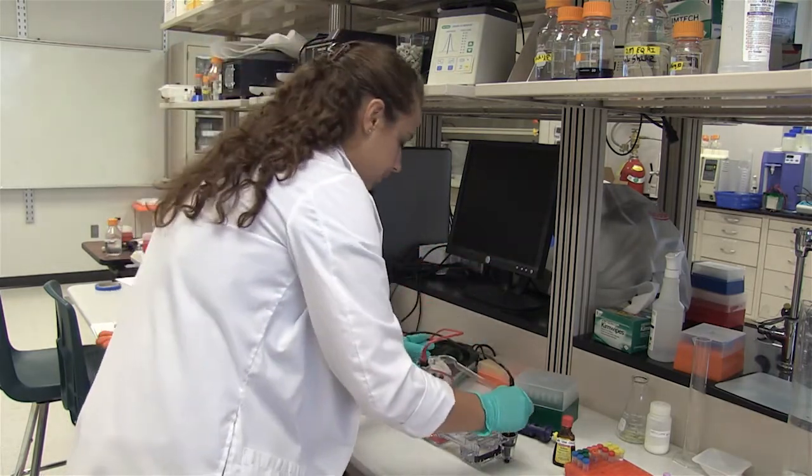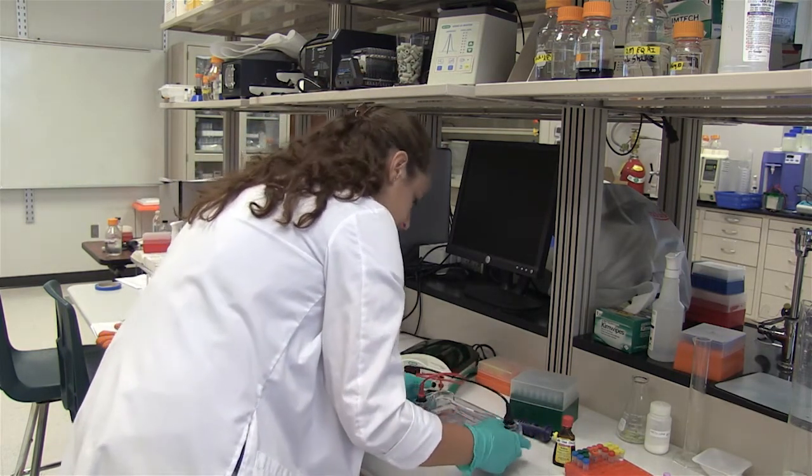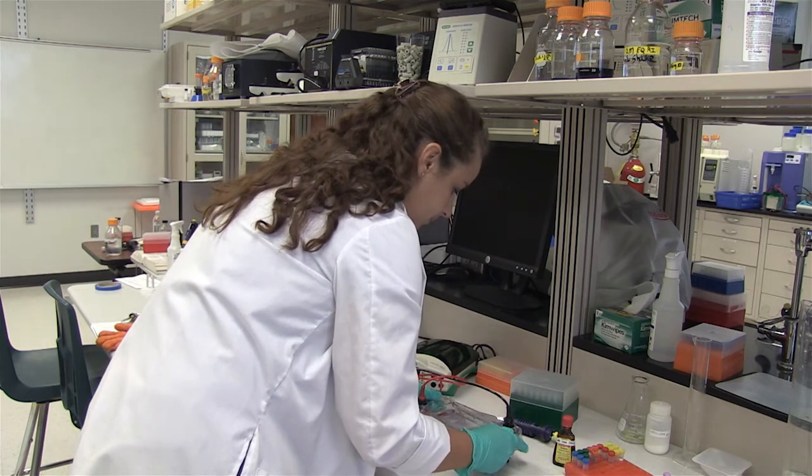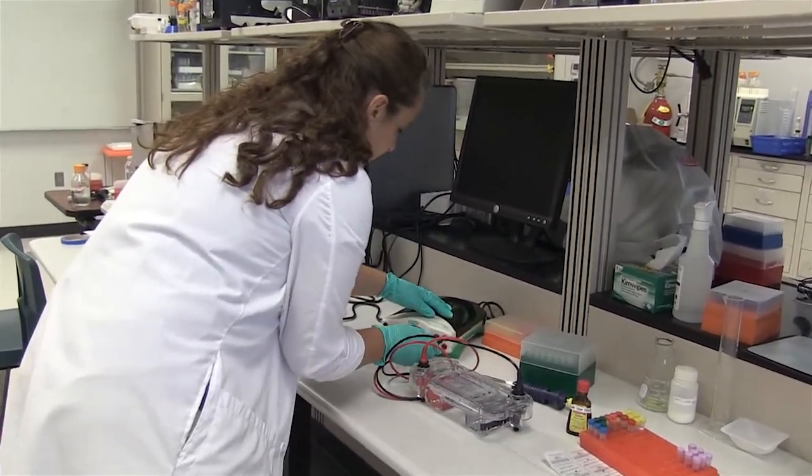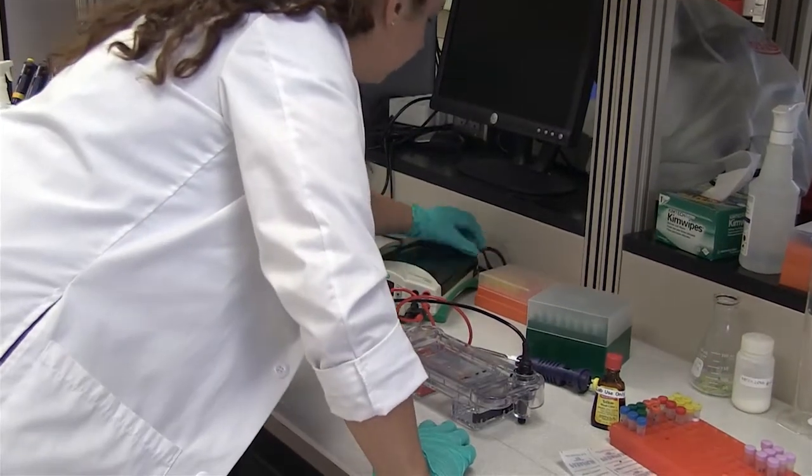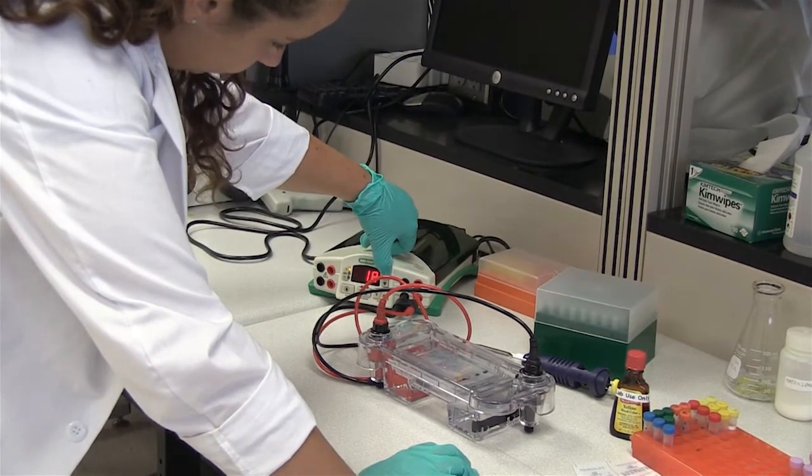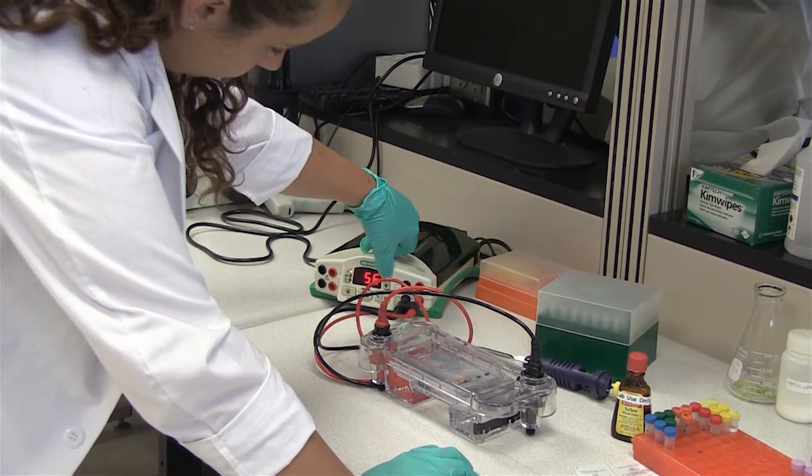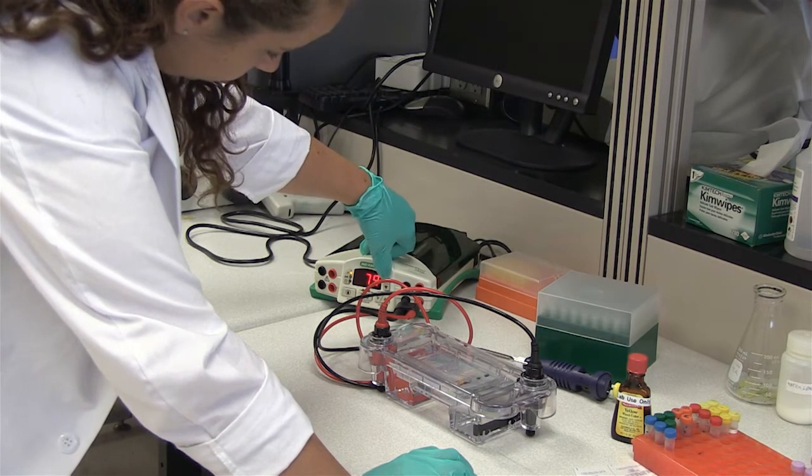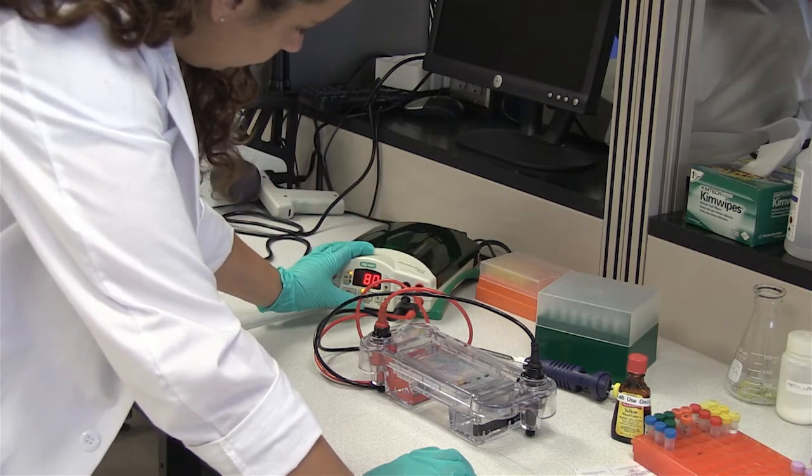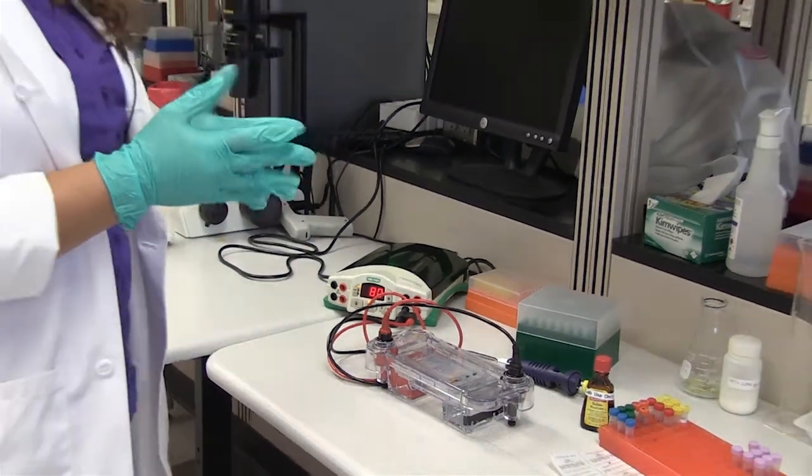So now what we're going to do is put the top of our box back on. Remember that you want to make sure you match up the red with the red, and the black with the black. Plug it in, and turn it on. What we're going to do is set the voltage for 80. And you are going to run your sample for about 45 minutes to an hour, until the dyes actually start to separate into bands.